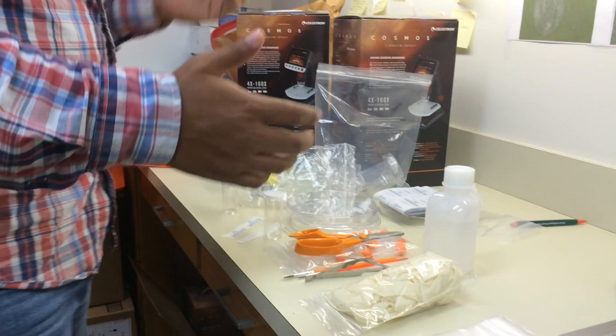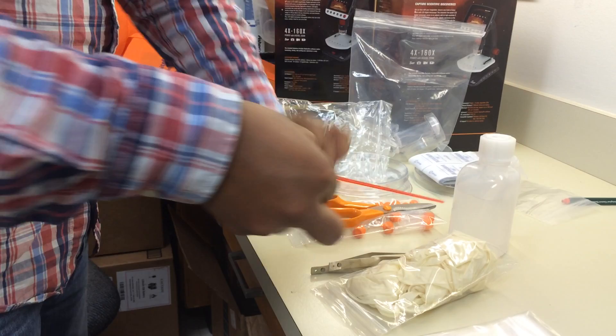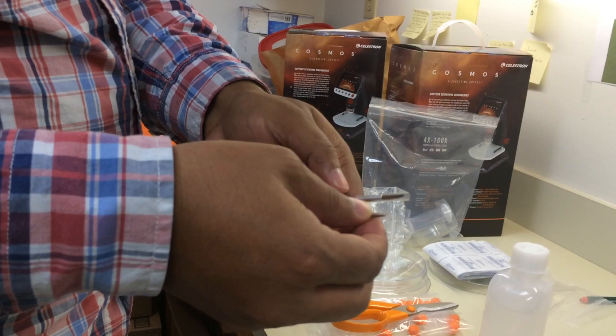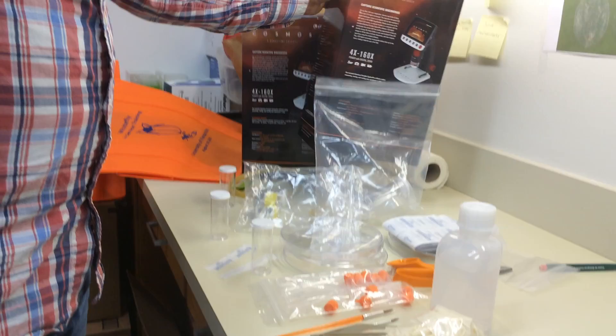After collecting, we have provided two types of forceps in the kit: one is a narrow tip and the other is a wide tip. We also have two types of camel hair brushes — one with a thick head and one with a small head — to deal with various sizes of samples.